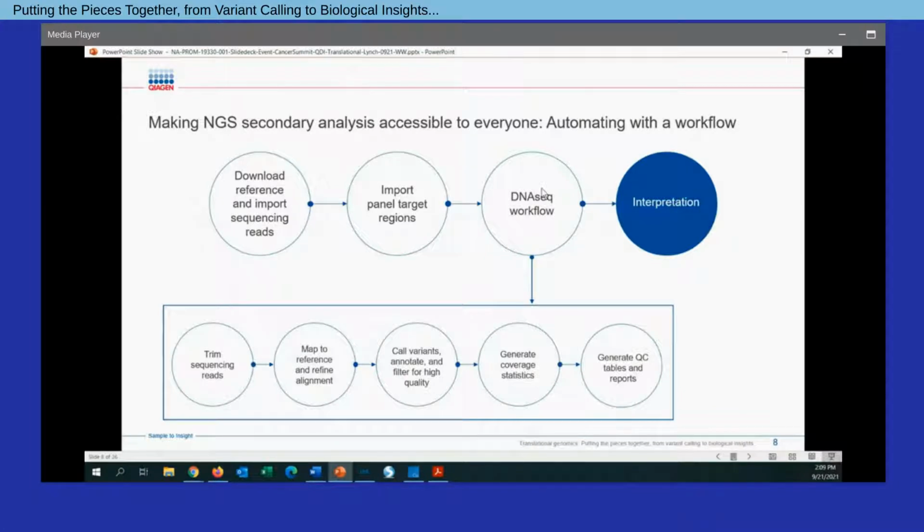Now, for today in particular, because we are working with germline sequencing, just some of the steps that will be included in the workflow that we're going to utilize: there'll be initially trimming of the FASTQ files to make sure we have accurate and high quality sequence to begin with. Then we'll go through the steps of mapping to a reference genome and various alignment refinement steps. The next step will be to call variants and then annotate them with transcriptional information as well as variant database information and do a number of filtering steps. And then from there, we'll cover generating various QC reports.